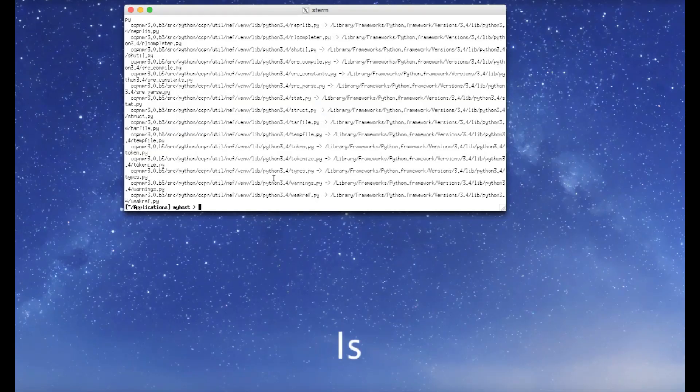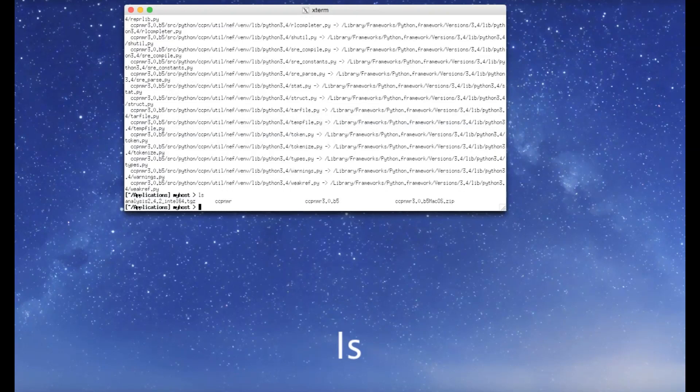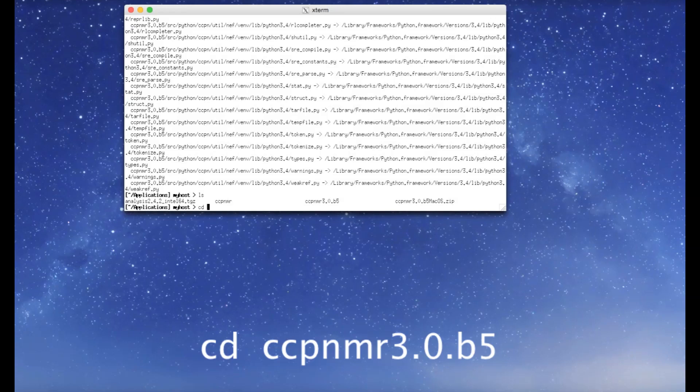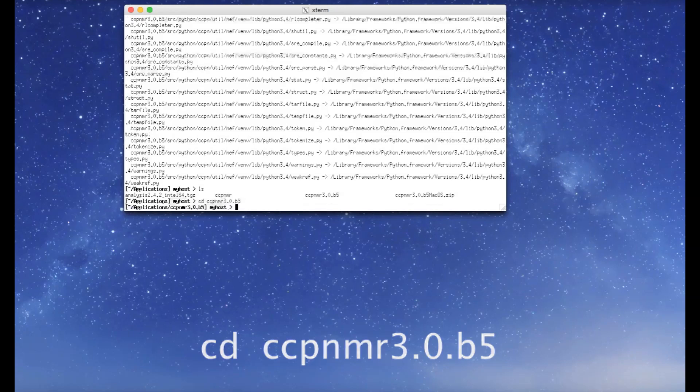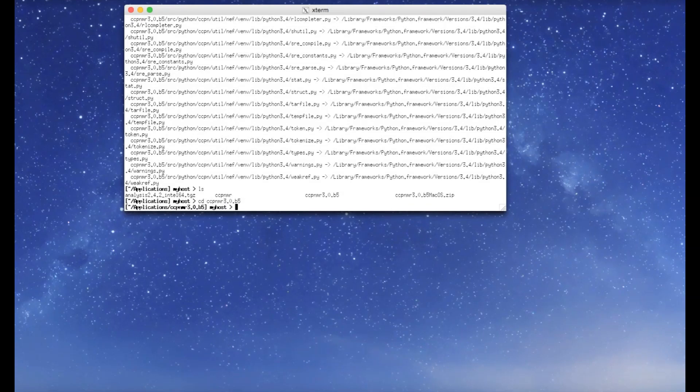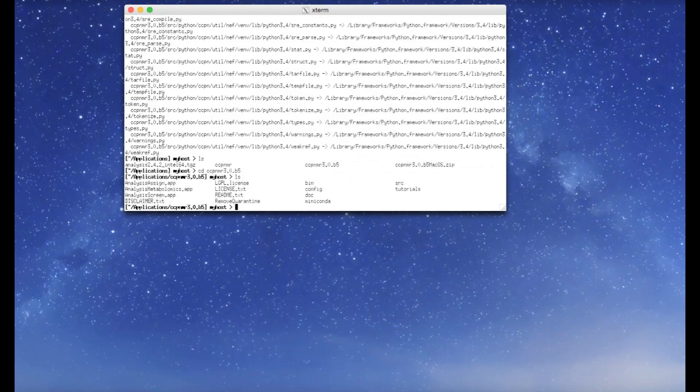you will find that you have a new directory, ccpnmr3. Go into that directory. And in here, there is another directory called bin. Go into there.